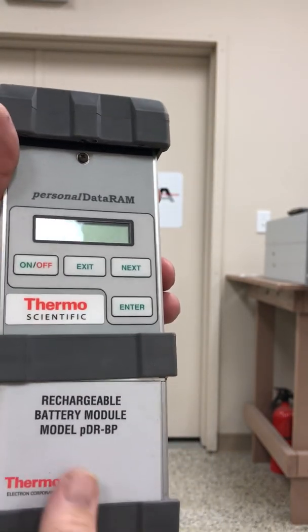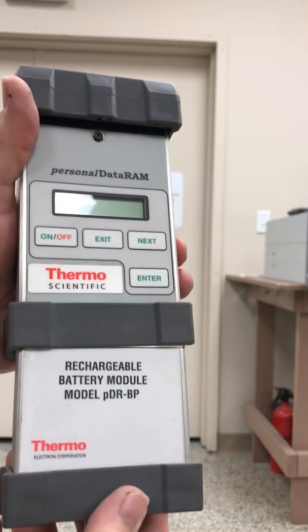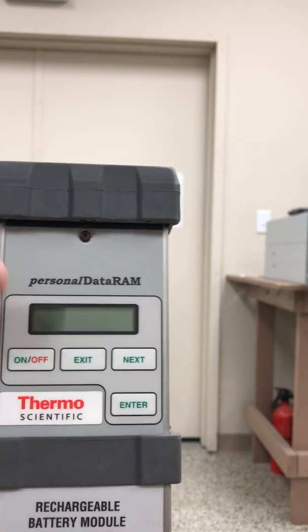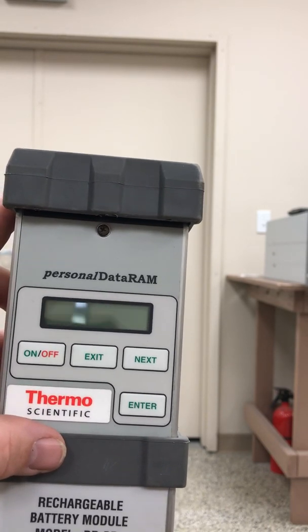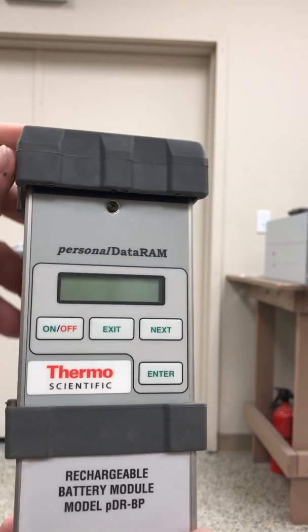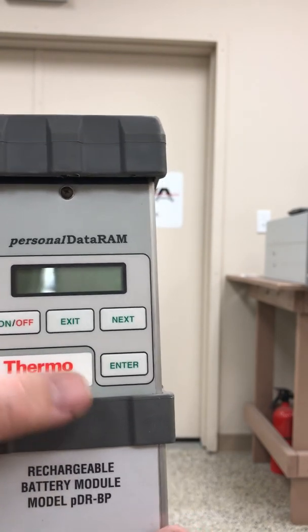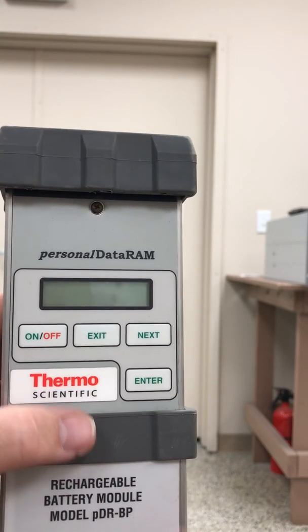This unit has a rechargeable battery pack module for extended operation. You can also take a 9 volt DC battery inside, in the bottom here, and it can have an external DC voltage adapter that you plug into AC and convert to DC as well. So there are three ways of getting power to this unit: the battery pack, the 9 volt battery, or the AC to DC adapter module.